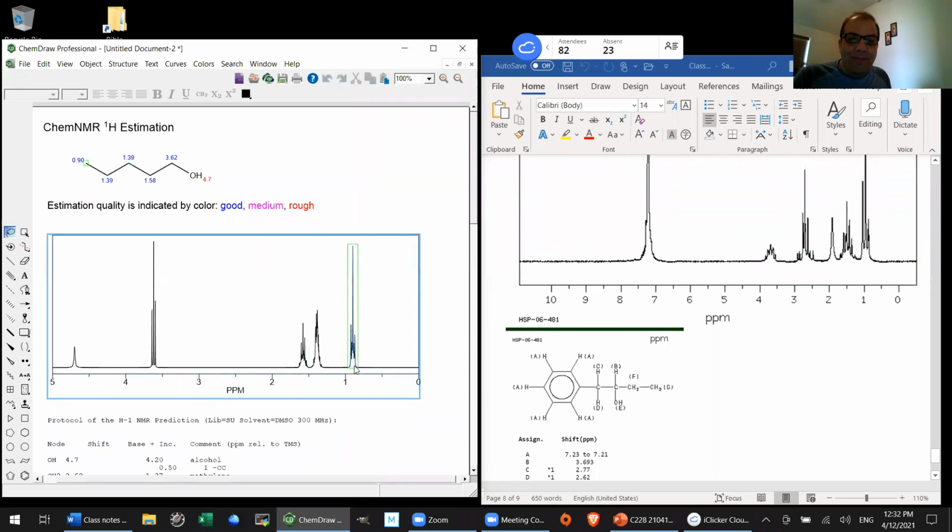Well, the methyl isn't horrible, but the methyl is also affected. That may be some long range splitting, maybe some splitting over more than 3 bonds. That can sometimes happen. And this one here, what a mess that haystack is. That's likely because you've got multiple types of adjacent hydrogens, and so it's not always the case that you could just simply add them all up and then add 1. You might get more splitting than that.